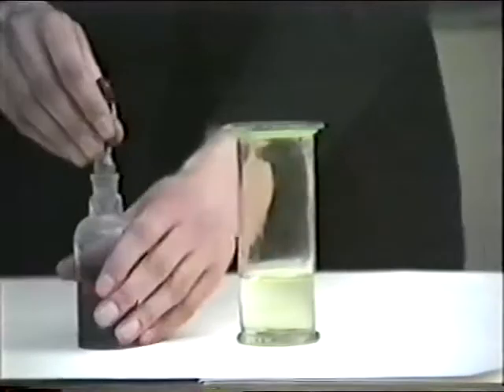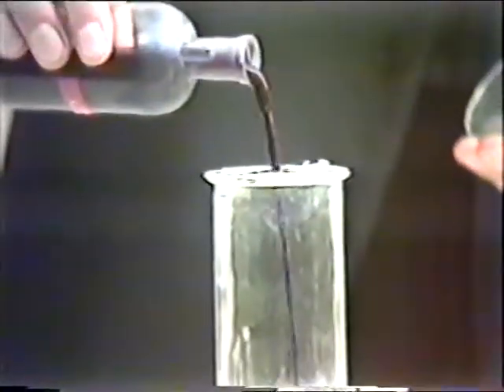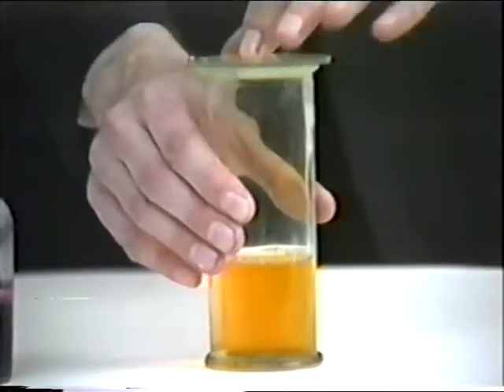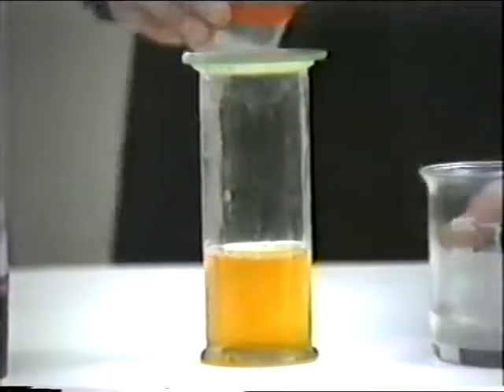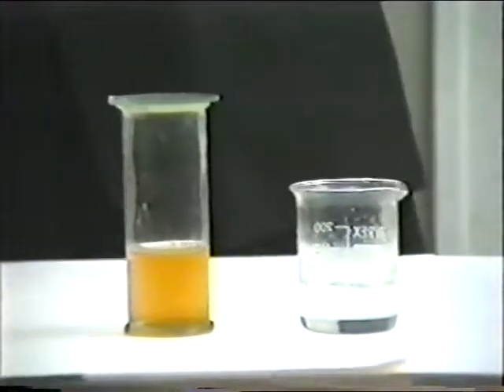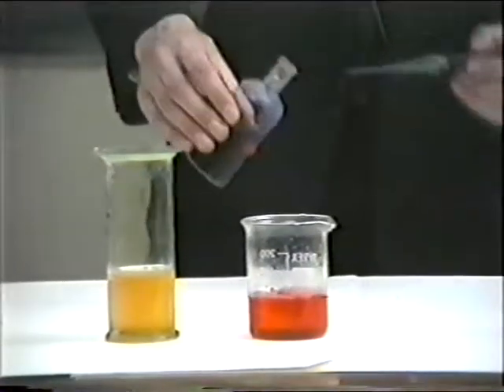And we can demonstrate the result of this reaction by pouring in some litmus solution, which tells us the difference between acids and alkalis. You will observe, as I remove the lid, it's rather difficult to remove because of the partial vacuum which is formed, that the solution turns pale red, which shows that the solution is an acid. I can demonstrate for you the reaction between litmus and another acid, a conventional acid, dilute sulfuric acid, and you will observe that in this case the indicator turns bright red.